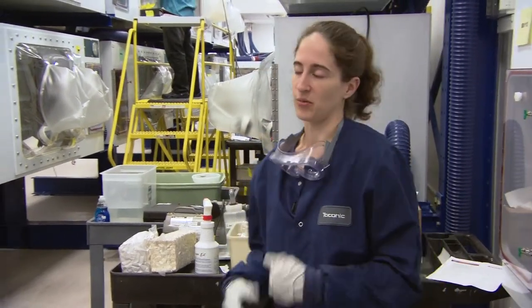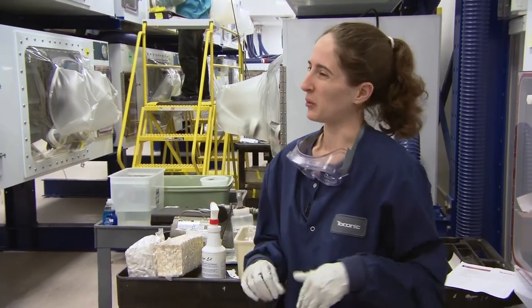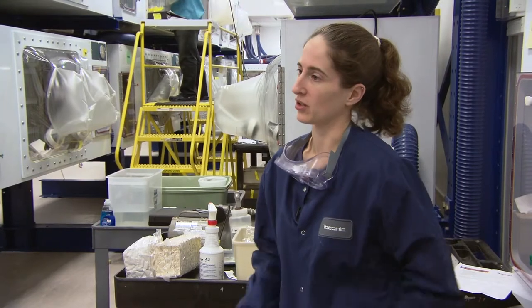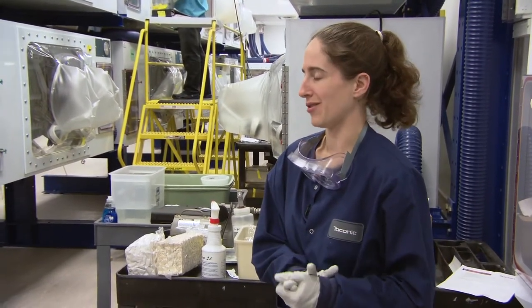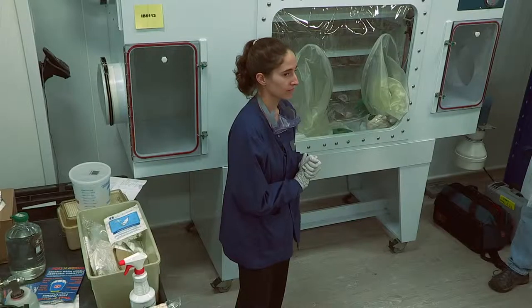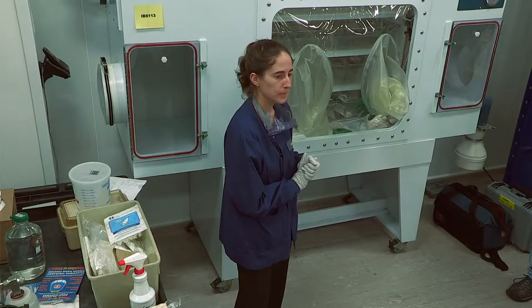There's no ill effects that we can see as far as reduced litter size, but mostly what we're working with here is transgenics or custom-generated models, so the background info might not all be there. The amount that's used is so small, and an isolator will have 15 to 20 air changes per hour — and here it's considerably higher — so it really isn't a consideration. It's gone very, very rapidly.